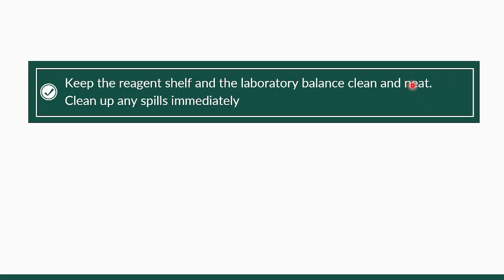Or dili sila mahaluan sa mga contaminants. Then, ang analytical balance, dapat clean and limpyo siya. Tapos, clean up any spills immediately. So, if naay mga yabo, if naay mga liquid nga nag-spill, dapat takbuhan lang na dayon.